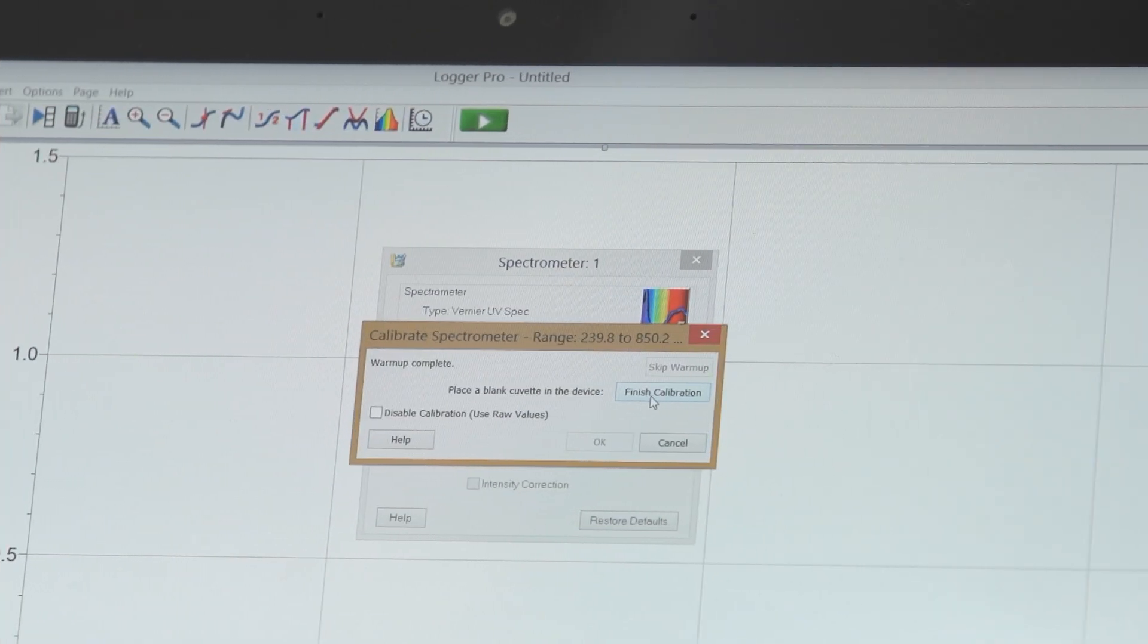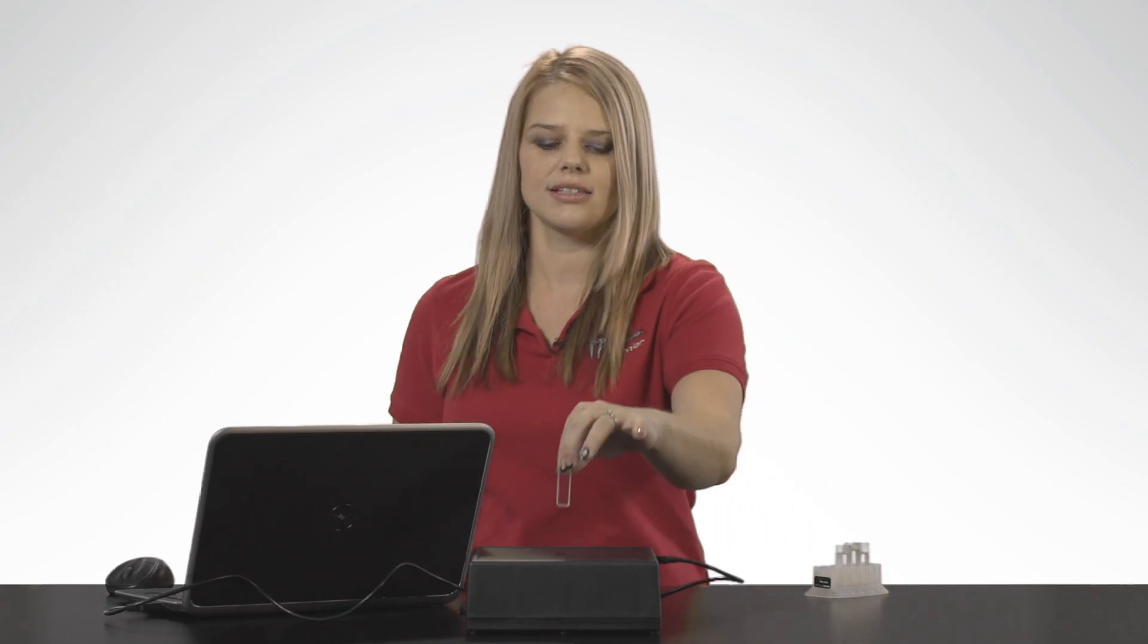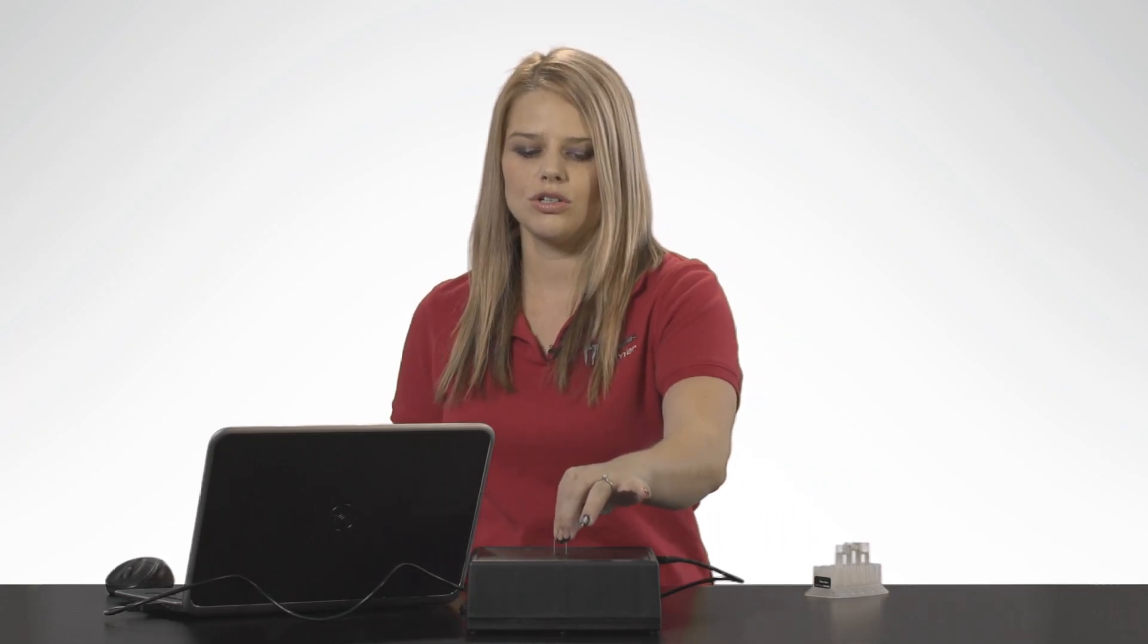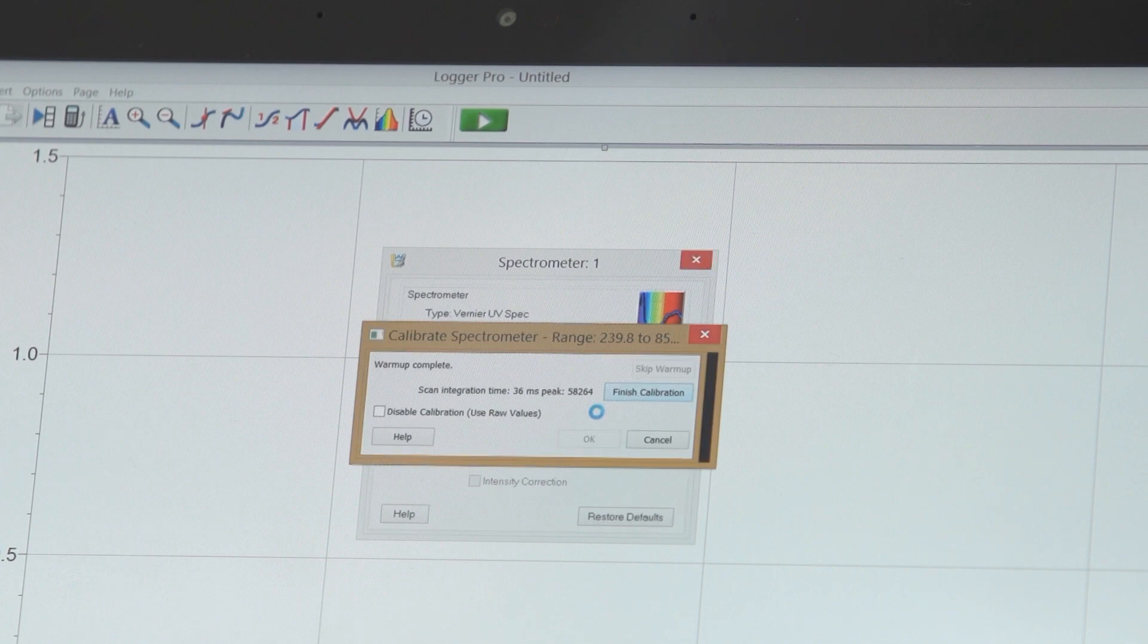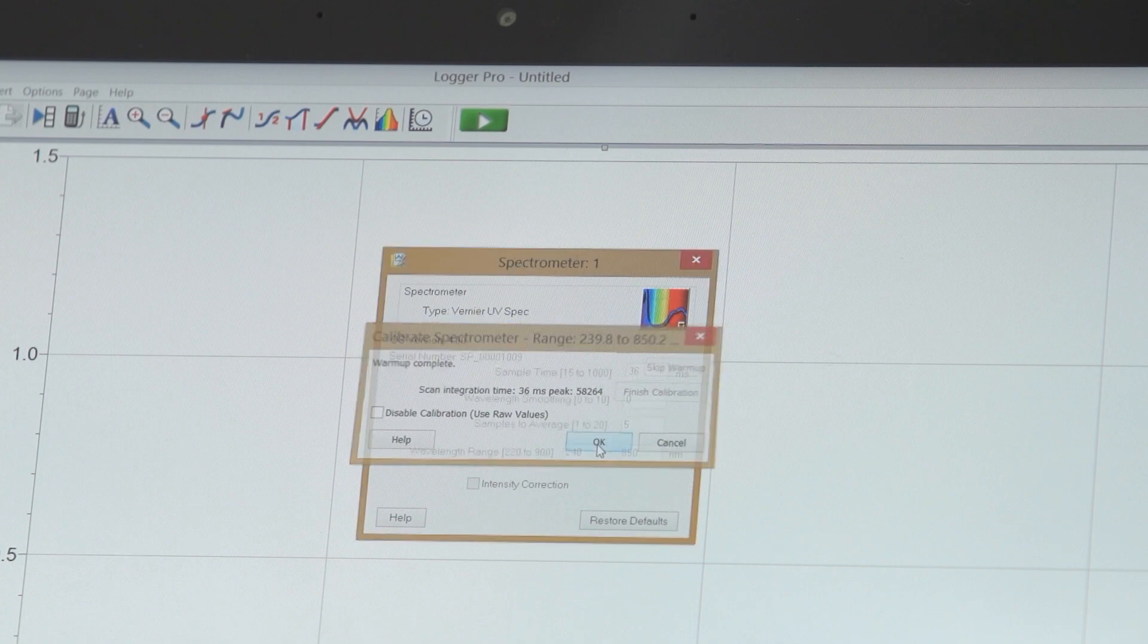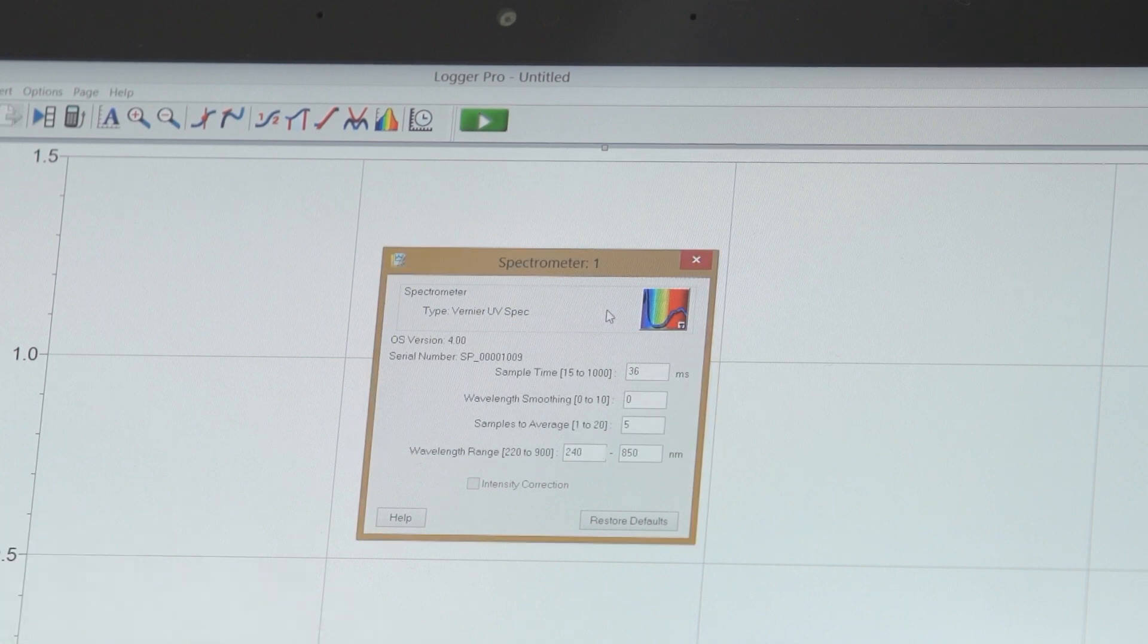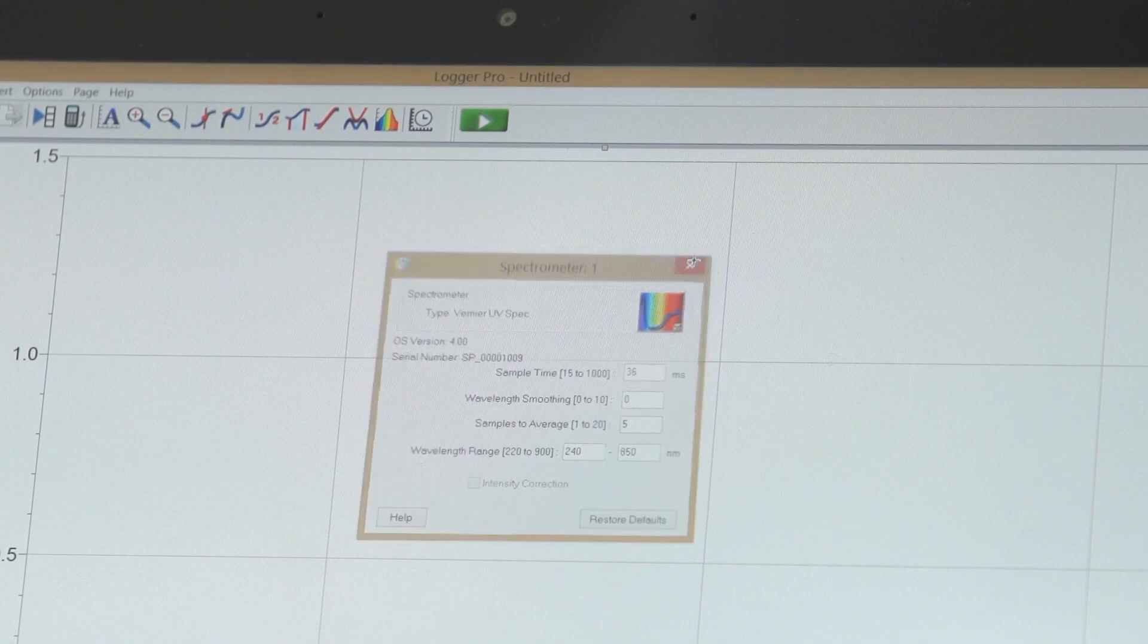Once the Finish Calibration button is available, then I'm going to put my blank sample into the spectrometer. Today I'm just measuring the absorbance of aspirin samples, so my blank is water. Select the Finish Calibration button. It'll take a few seconds. And then I select the OK button. Now I can close out of this dialog box, and I'm ready to take data.